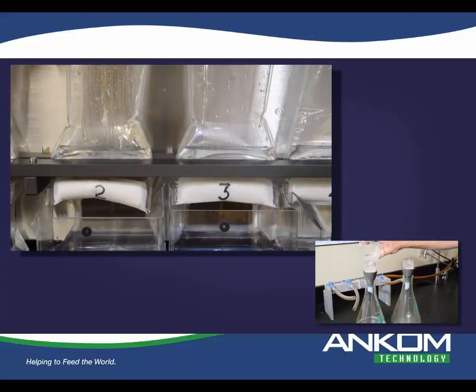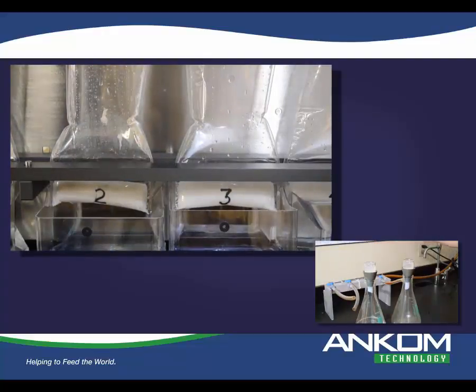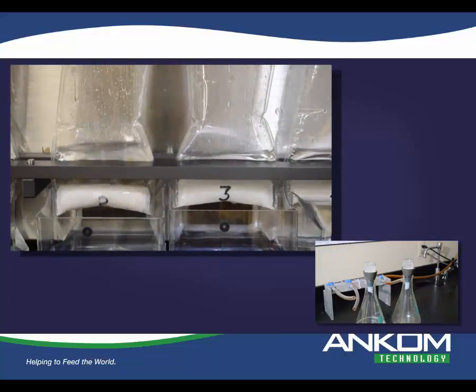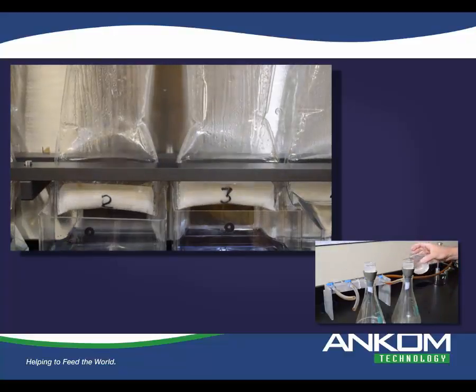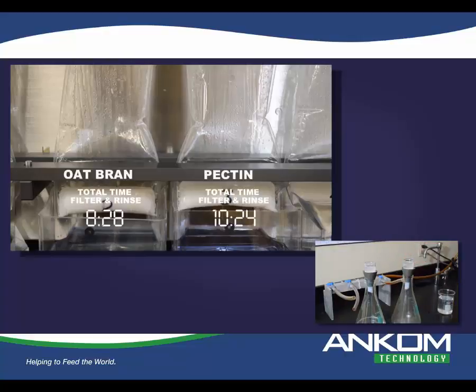In other words, you disrupt the gel, you don't disrupt the diatomaceous earth base. If you look at a laboratory doing it, you'll see a slight scratch, which would be expected in the diatomaceous earth base, but you do not want to dig into that, or specifically go to the glass in order to increase your filtration. If you do that, you're changing the porosity of it, and you're going to likely lose some of your particles in that process.